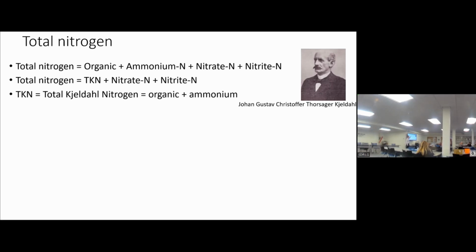Except myself, only myself? You will find sometimes these TKN. What's TKN? Who has seen TKN before? All right. So there was this guy, Kjeldahl, some Danish guy that worked, believe it or not, for a beer company. Turns out that you need to know how much protein is in the malt, like in the barley, to decide how to make the process, how to make beer.